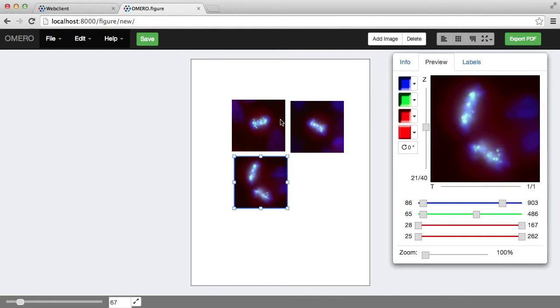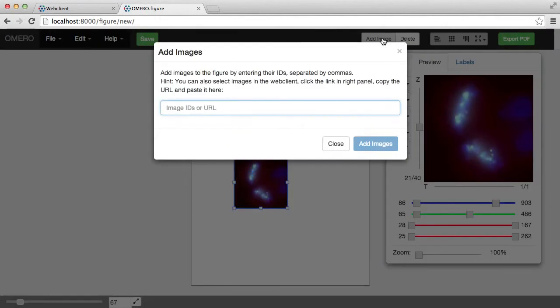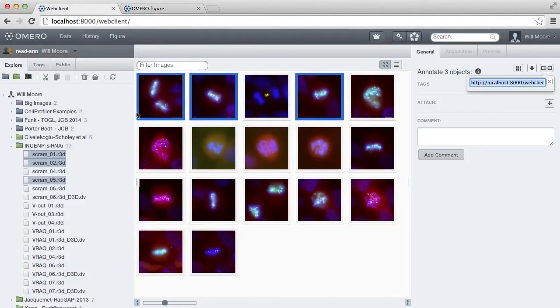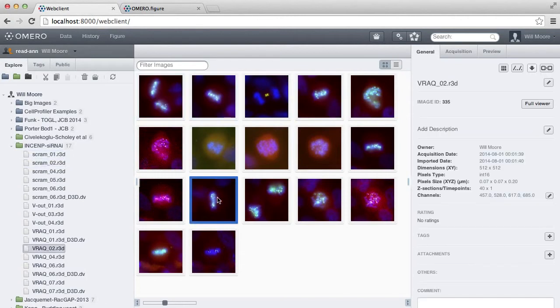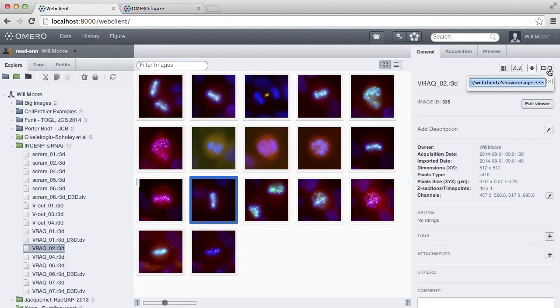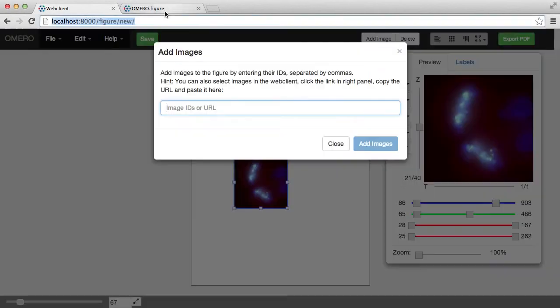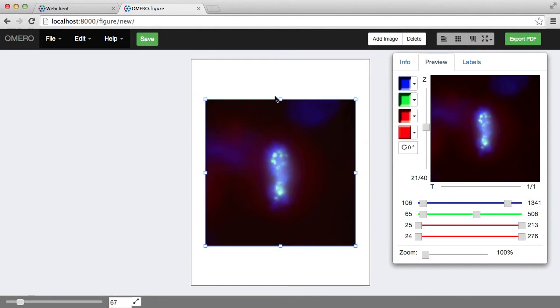If I want to add more images, I can go again to this Add Image button at the top there, go back to Web Client, let's just choose a single image this time, and again copy the link, paste the link here, and that will bring additional images into the figure.